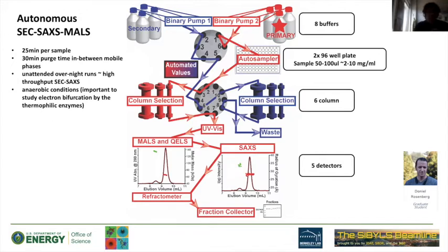On our mail-in page, you have information about which columns you can select. You also need to add the sample name and the minimal information we need, which is the volume that you are shipping to us. If you add a little comment, or the concentration at least, what you expect to have in your sample, it will allow us to give you a little more information.